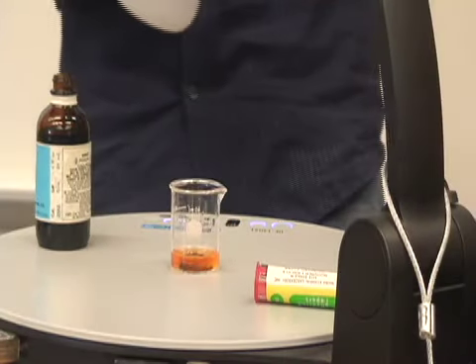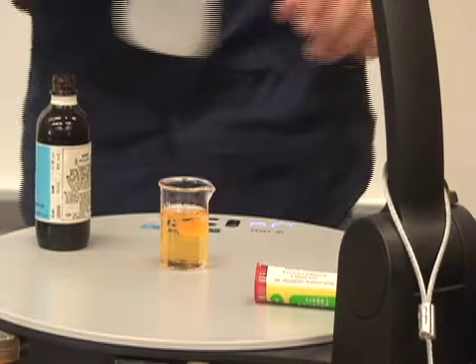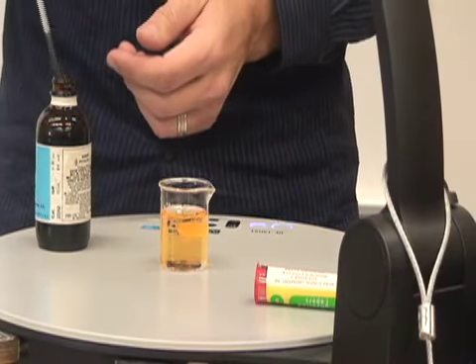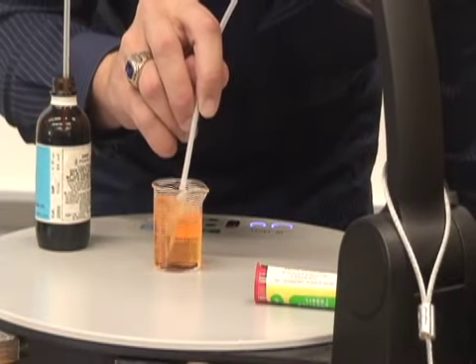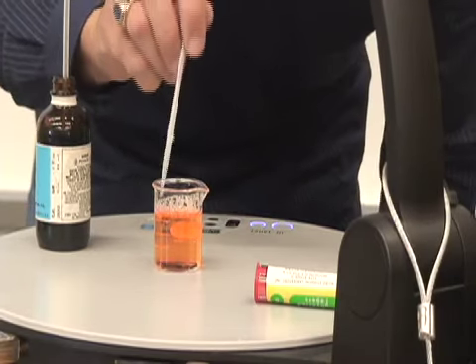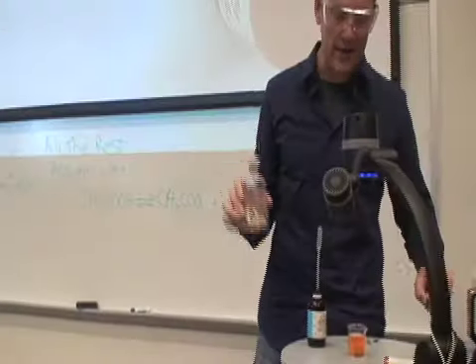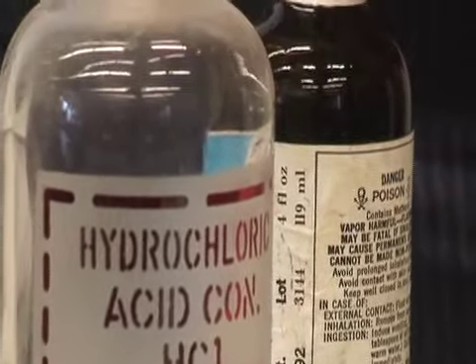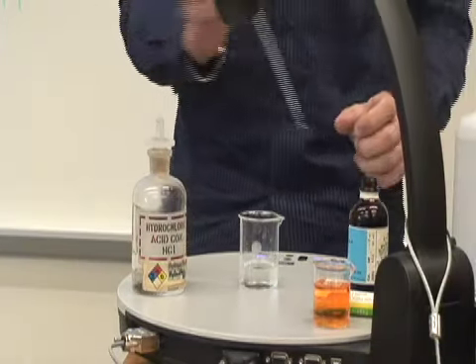I can increase the volume of this demo a little bit. I just put in a little bit more water. I'm going to put in a little bit more indicator because I want you guys to all recognize. Alright. I want you to think about why. Concentrated hydrochloric acid is about 13 molar or so. By the way, this is distilled deionized water.